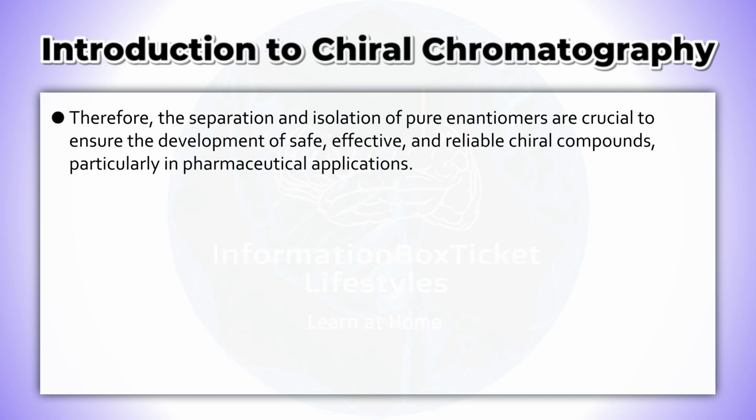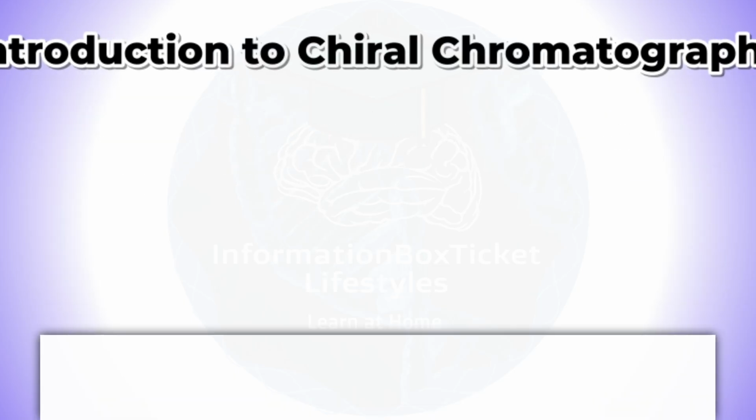Therefore, the separation and isolation of pure enantiomers are crucial to ensure the development of safe, effective, and reliable chiral compounds, particularly in pharmaceutical applications.